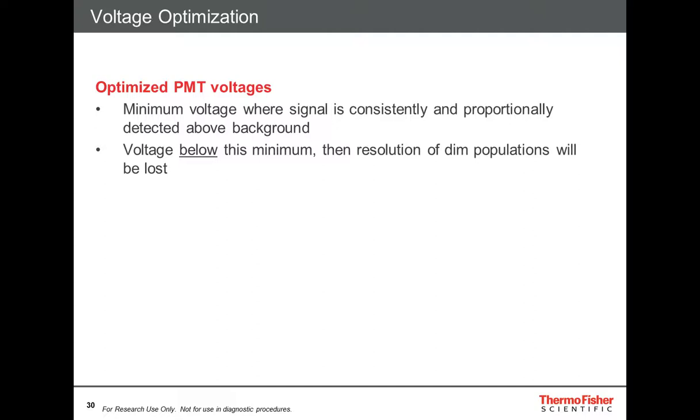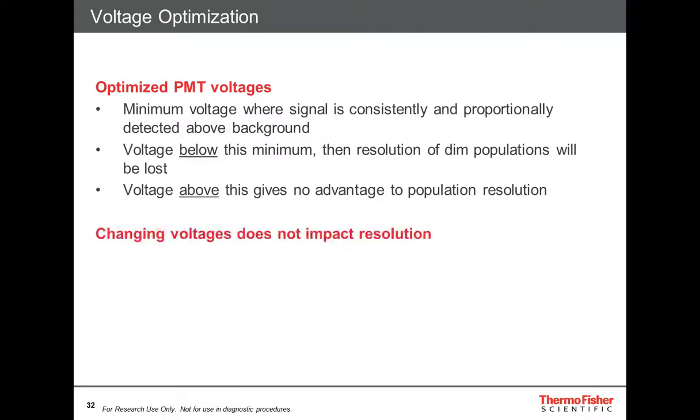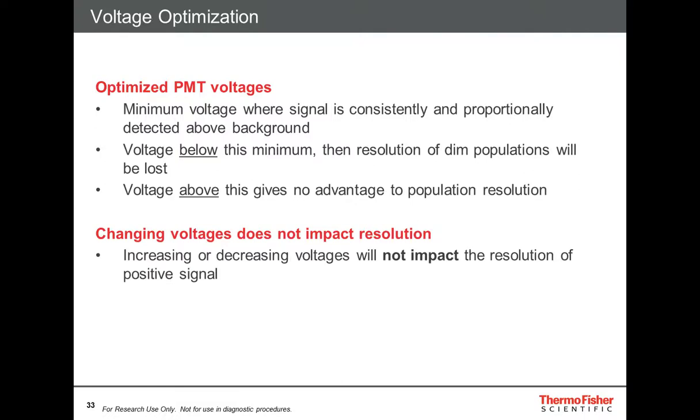If I have to do that, I know that I may be sacrificing signal to noise, but at least I have an understanding of that. And with GFP, if I'm only looking at something bright, signal to noise may not be my most important consideration. If I raise the voltage, there's no advantage to resolution. So I don't want to change these just for resolution, and optimization is very important, so just get it done.